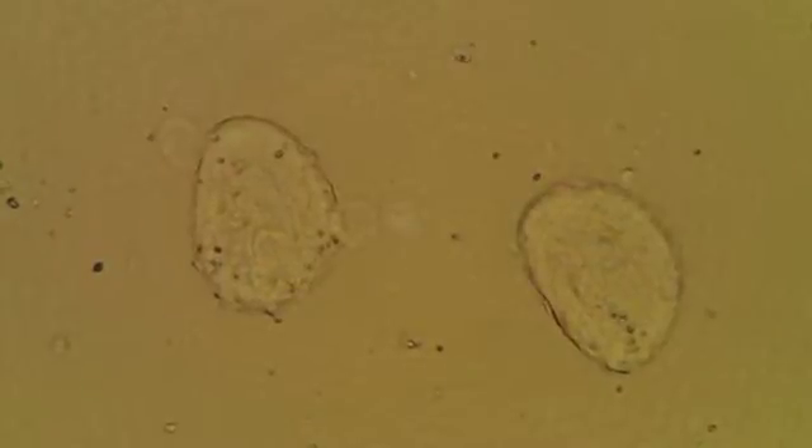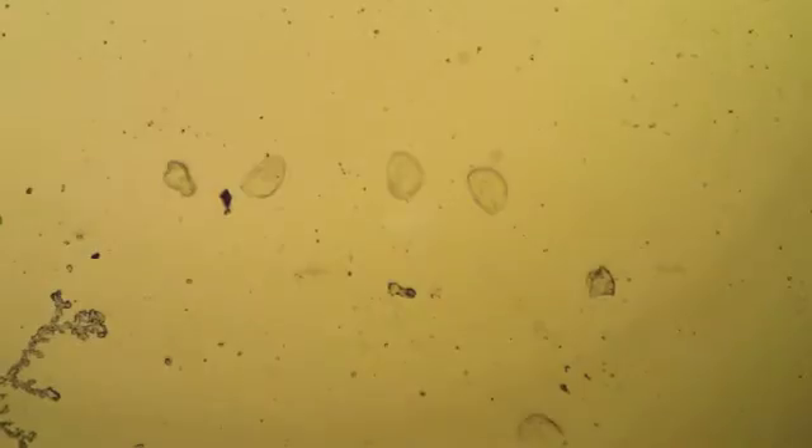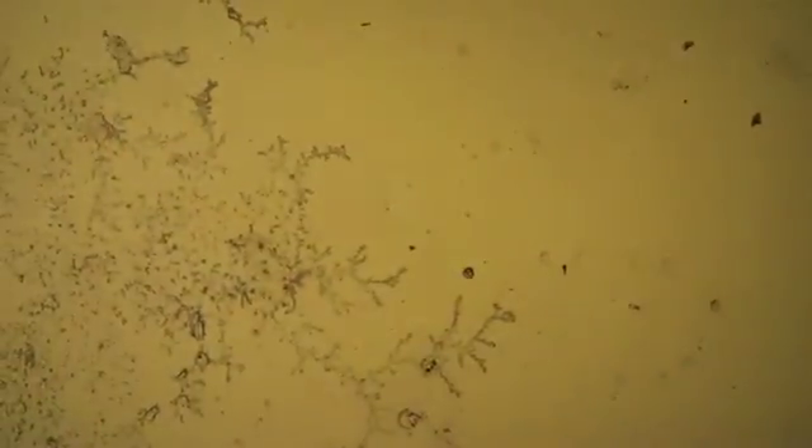We're at 40x objective lens. At low power — now at 4x magnification — you can get your eye in on these. But look, what else do we have here? This is in fact Gyrodactylus, the skin fluke. You'll notice the large haptors and the lack of the four eye spots.